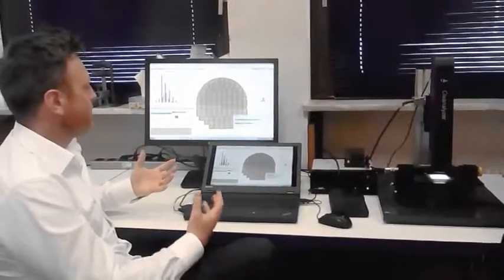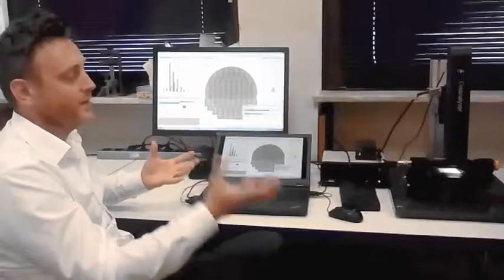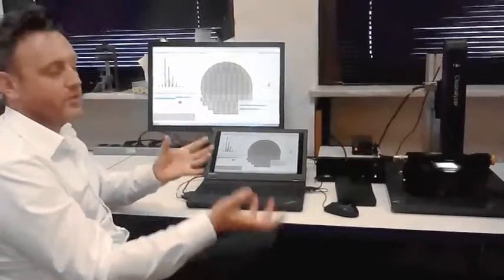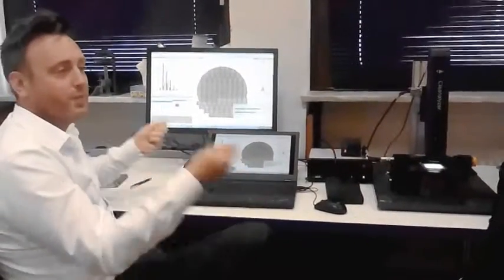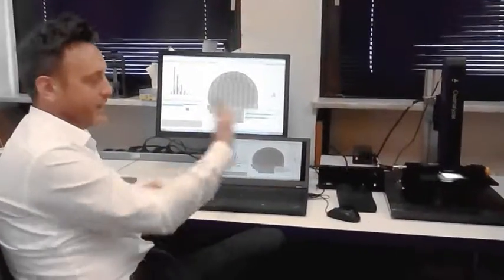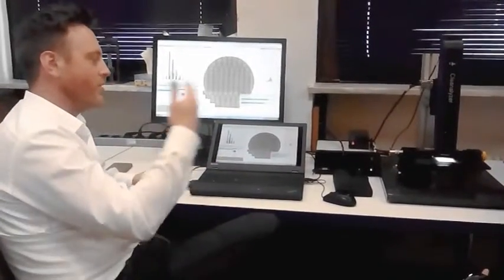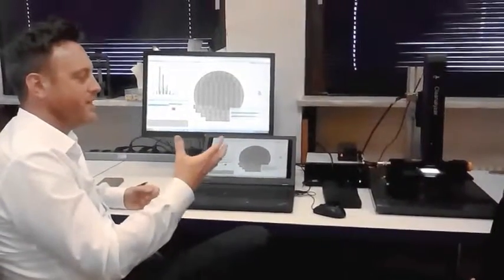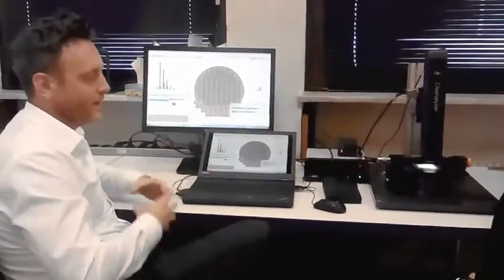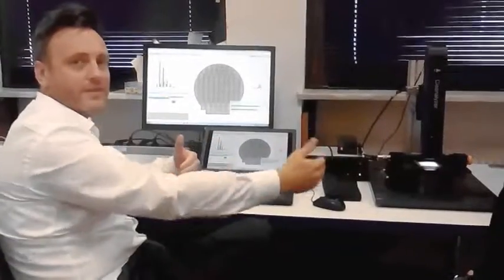So this has come from an object that was very dirty, and this would tell the user that he would need to take that whole batch of samples and put them back through his cleaning procedure, rewash it, and then come back to this and keep on going. So it would provide an ongoing verification procedure for a manufacturer and a cleaning process to ensure that no dirty parts are delivered to a customer.